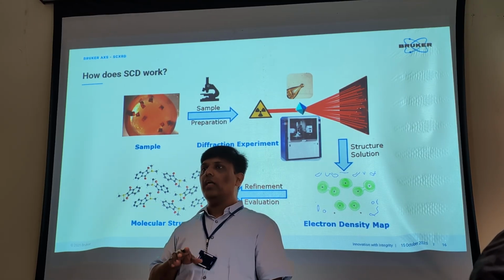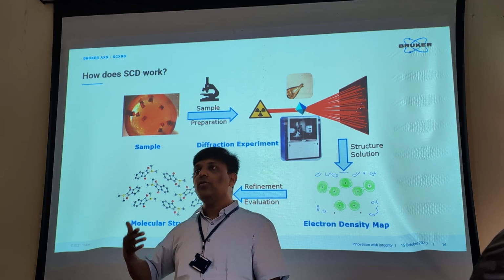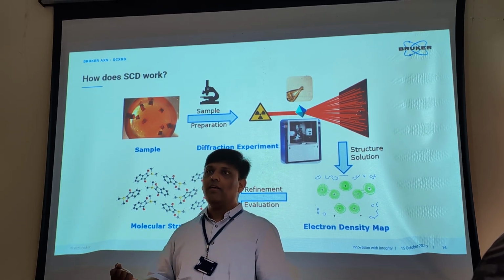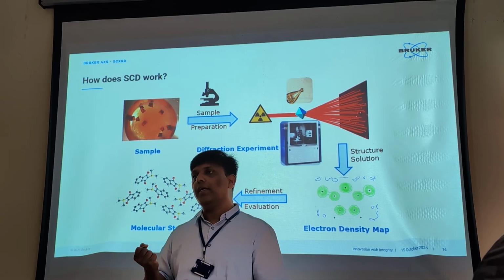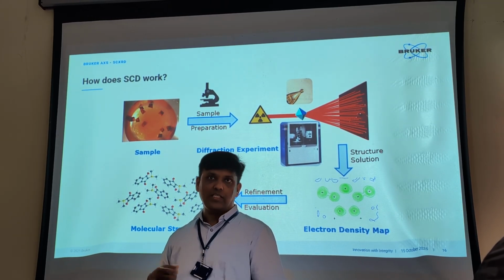It doesn't mean that you cannot use a smaller crystal. It requires more time, because you need a lot of X-rays to expose. But if you have a bigger crystal, then your data quality will be better and the time taken to collect the data will be much less.